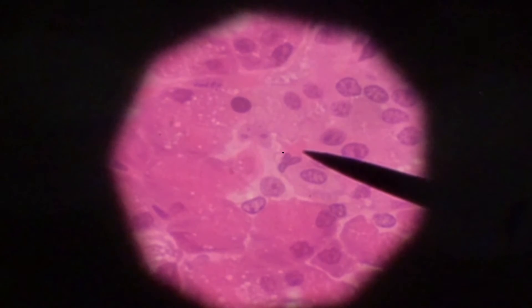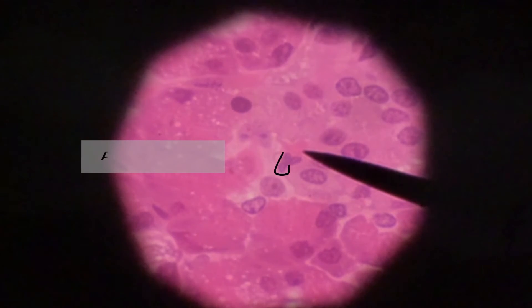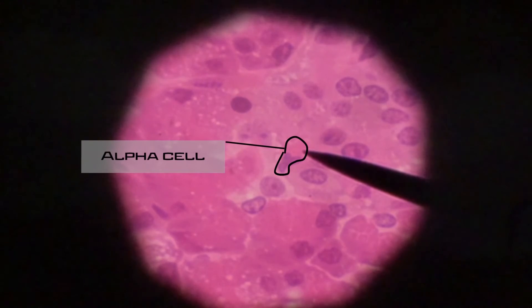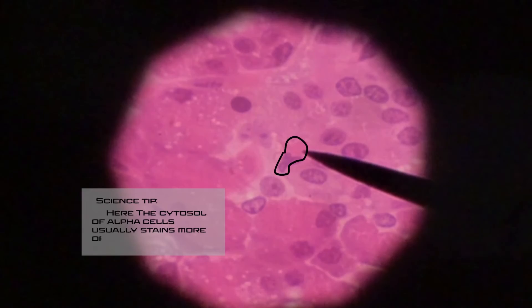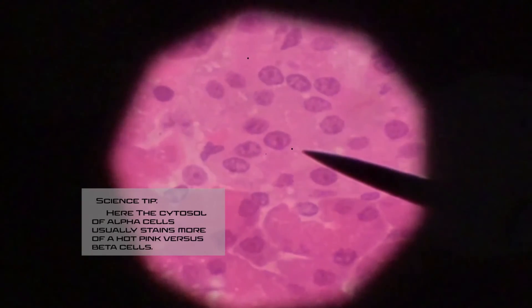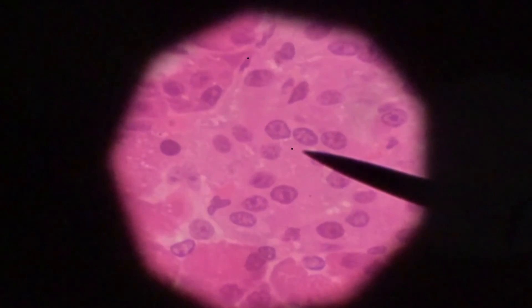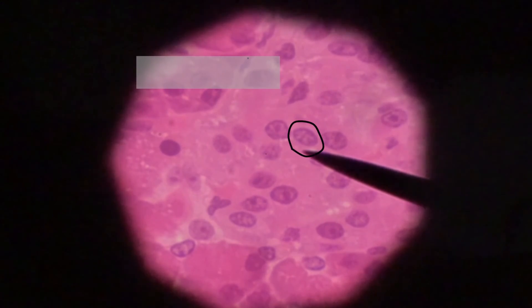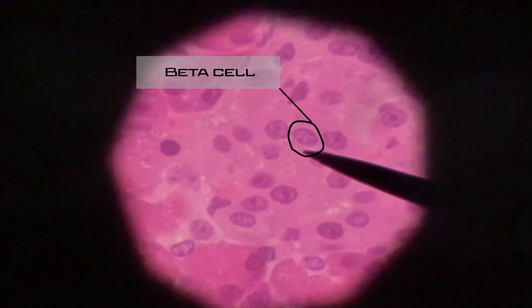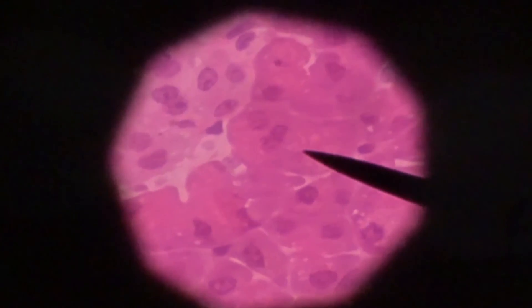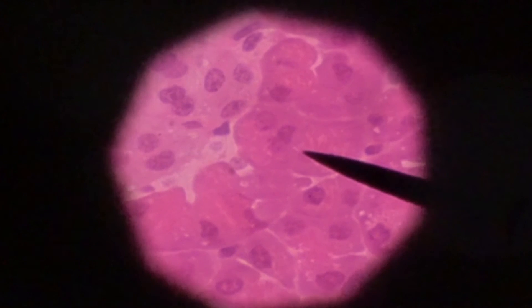Inside the islet of Langerhans there are two types of endocrine cells: alpha and beta cells. The alpha cells tend to stain a little darker and are responsible for producing glucagon. The lighter cells are the beta cells, and the beta cells are responsible for making insulin. This entire islet of Langerhans is surrounded by the acinar cells, which are used more for digestion. That's all we're covering in this video.